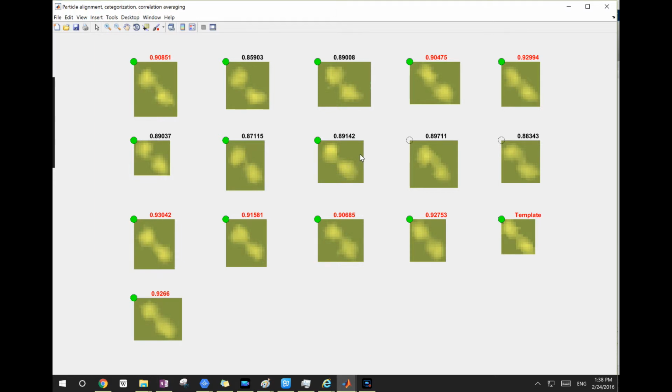Right, so basically we go back and forth between these. On the one hand, we use the computer to help us do it quickly. On the other hand, we manually review the ones that are selected by the computer and the ones that are deselected by the computer. We add ones that we think are true from the discarded ones by the computer. We throw away ones that are false positives, even though they are selected by the computer.